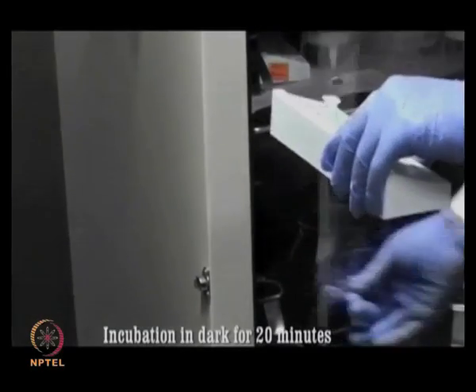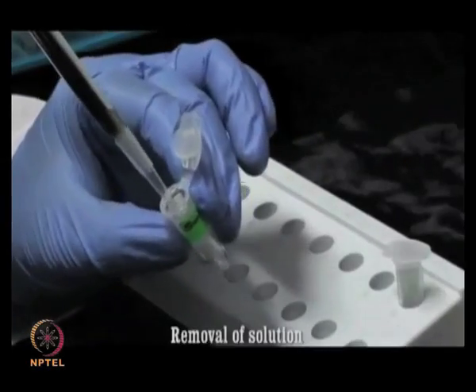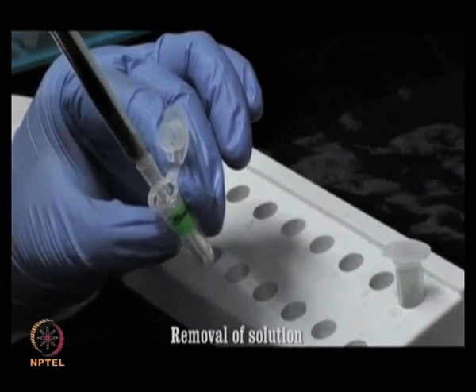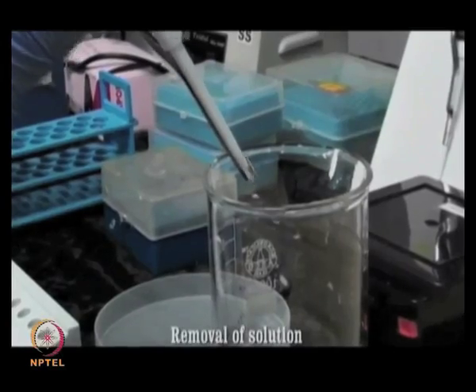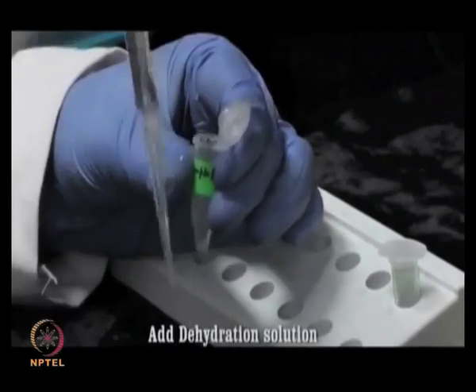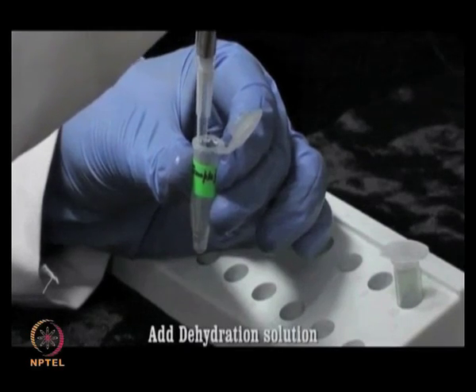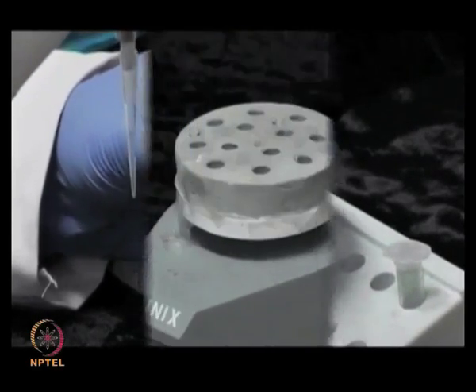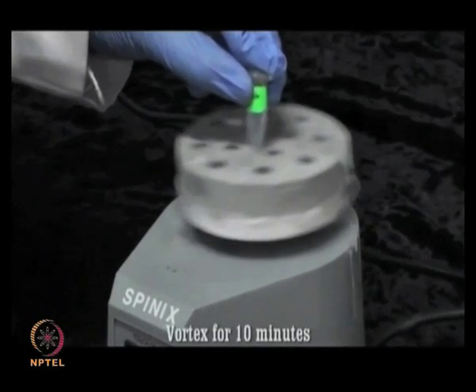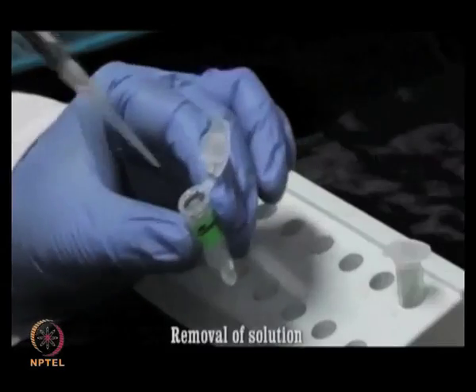Now, your incubation is over. So, you can remove the tubes and now remove the solution. Now, add 50 microliter of dehydration solution, mix it properly by vortexing and incubate it for 10 minutes.